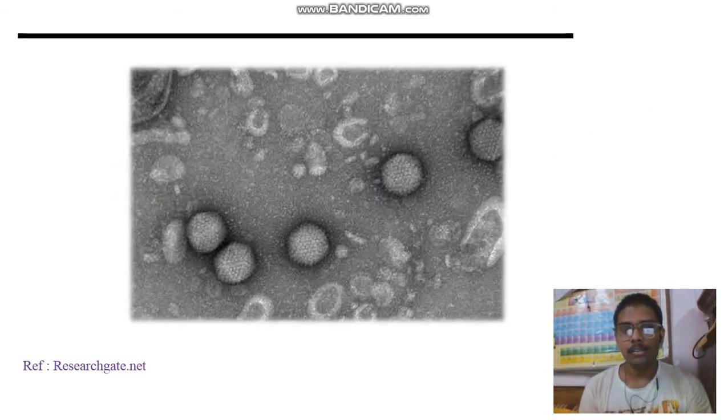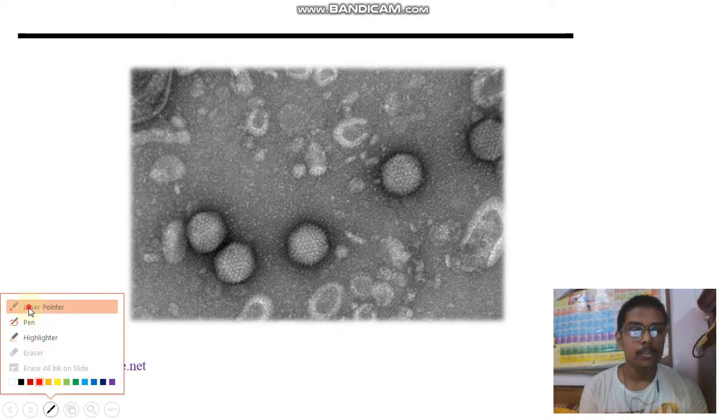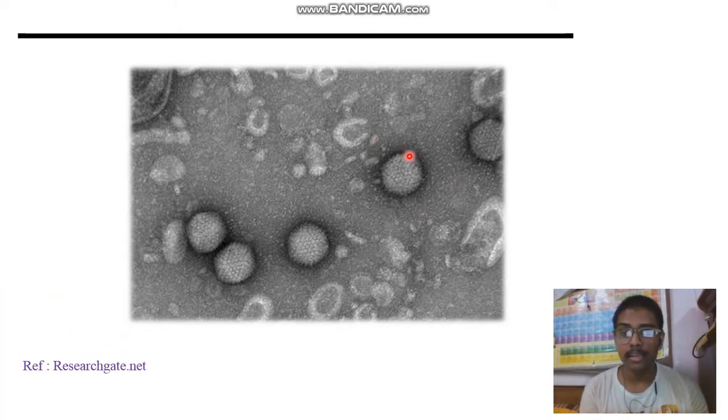Now this slide shows a black and white image from the SEM. This is a particular SEM image of some virus. Here you can see these 5 similar things; the spheres are actually denoting the virus. This image has been taken from researchgate.net. The dark spherical periphery denotes a difference in scattering from the inner bright spot. This dark periphery scattering pattern is different from the inner bright region. That's why the image is formed.